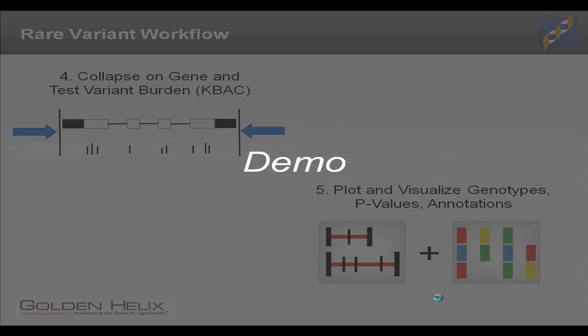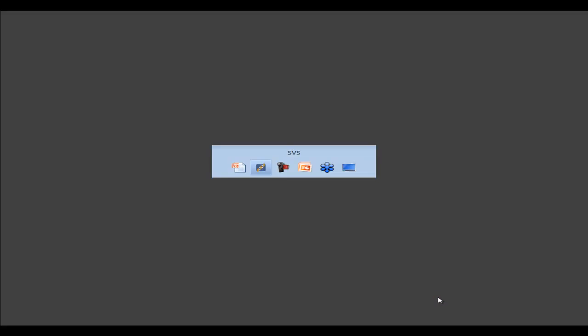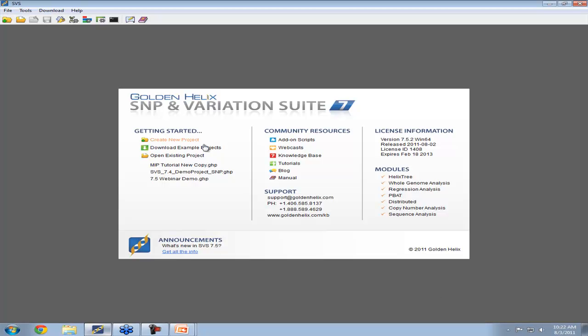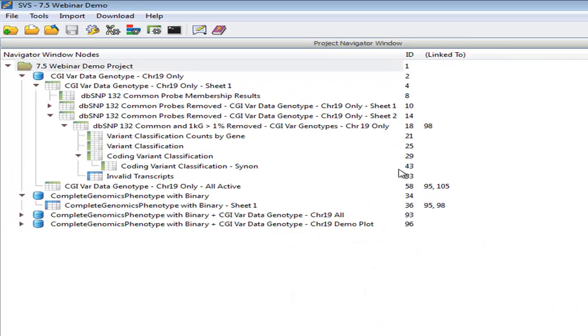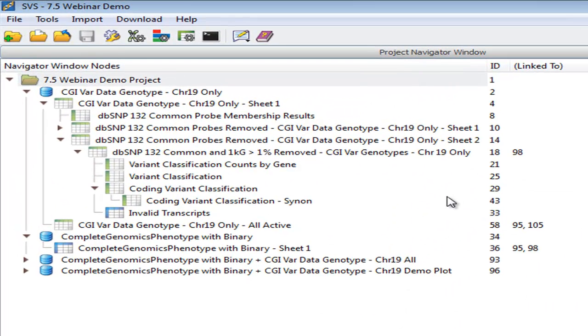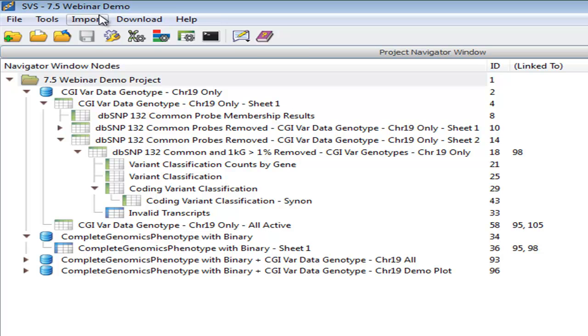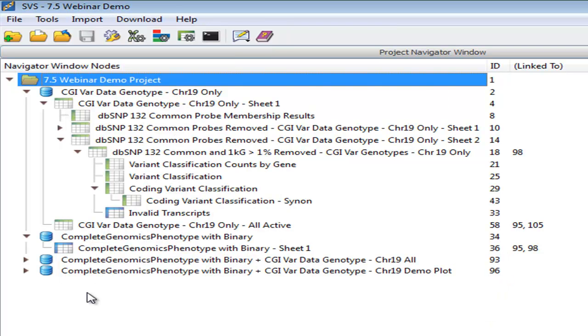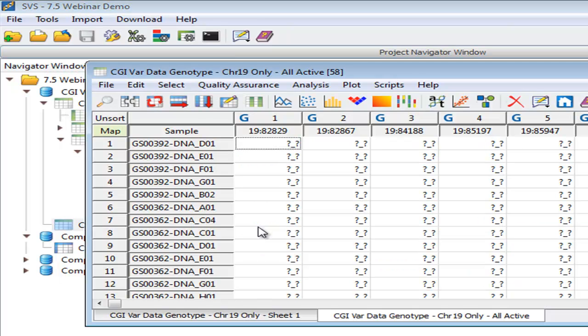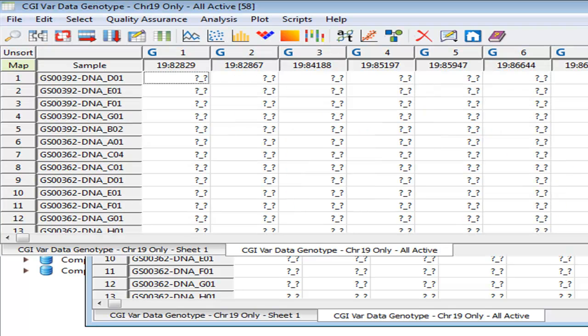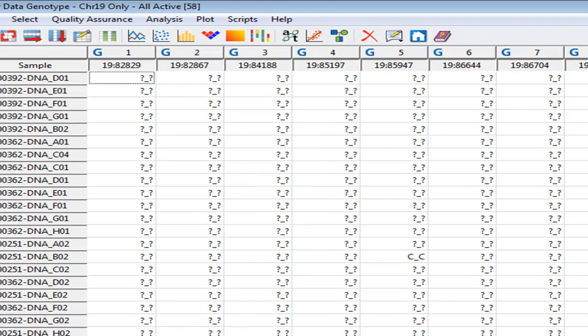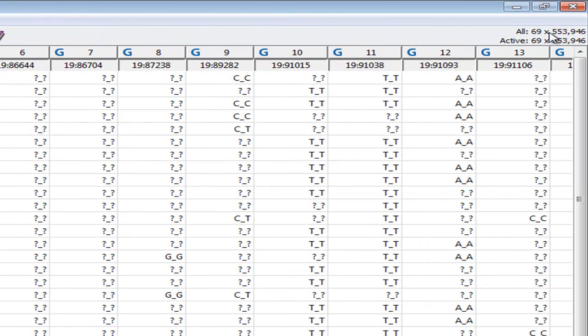Let's get started. I'm going to open up a project which I've already imported this data. Let's take a look at this spreadsheet. This is the complete genomics variant data as imported from our complete genomics import feature. I've already brought in just chromosome 19, so as I open up this spreadsheet, you can immediately see that we're already at 500,000 variants for these 69 samples.